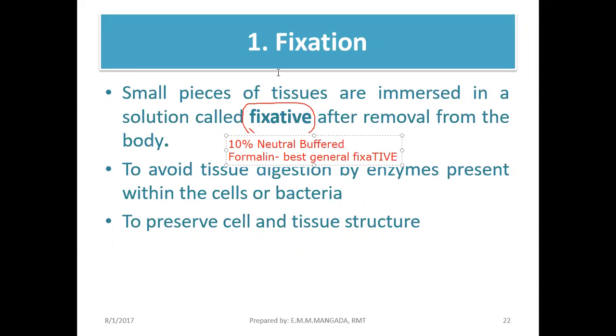Okay? Siya yung ating madalas ginagamit sa laboratory. It's usually at the 10% concentration. Okay? So, siya yung pinaka-common na ginagamit natin. It's actually the best general fixative. Okay? So what's the purpose of fixation? Of course, the purpose of fixation is to preserve the cell and tissue structure.